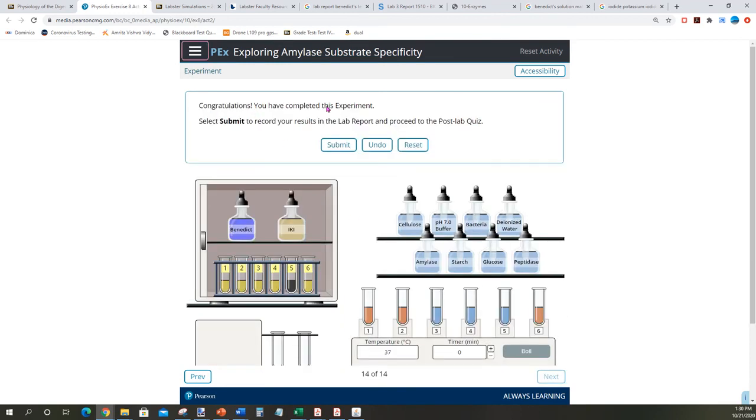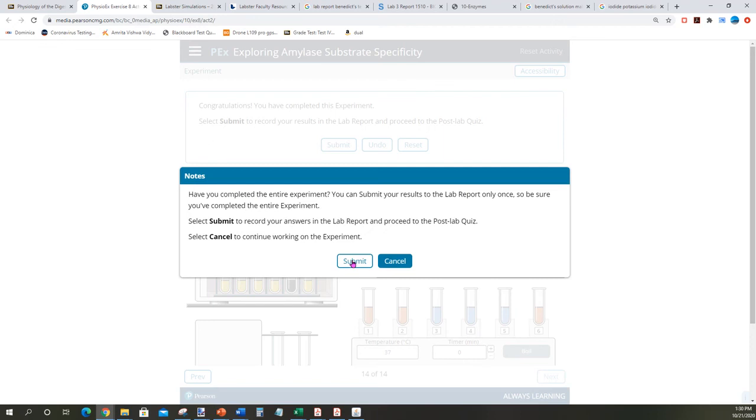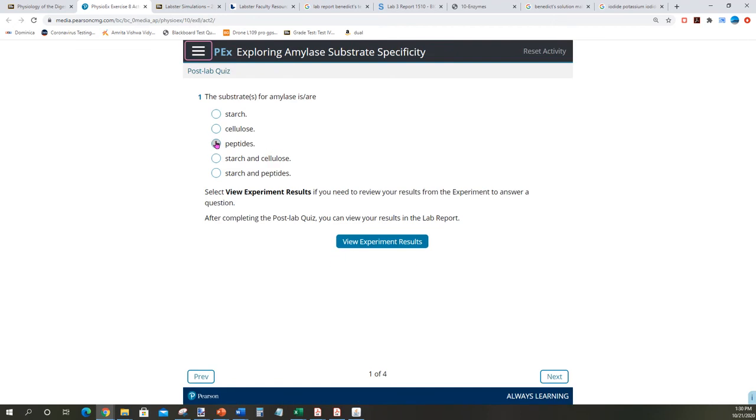Congratulations, you have completed this experiment, so select submit. Okay, submit. There are post-lab questions. It's going to ask you post-lab questions, so here you go. You answer the question.